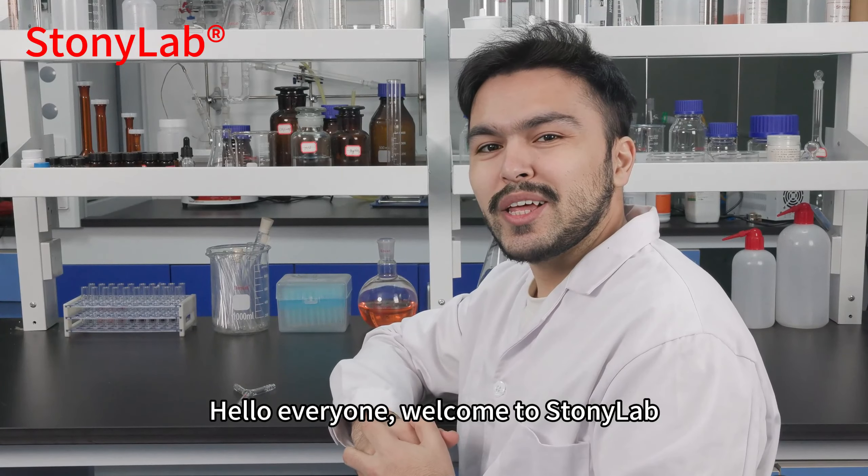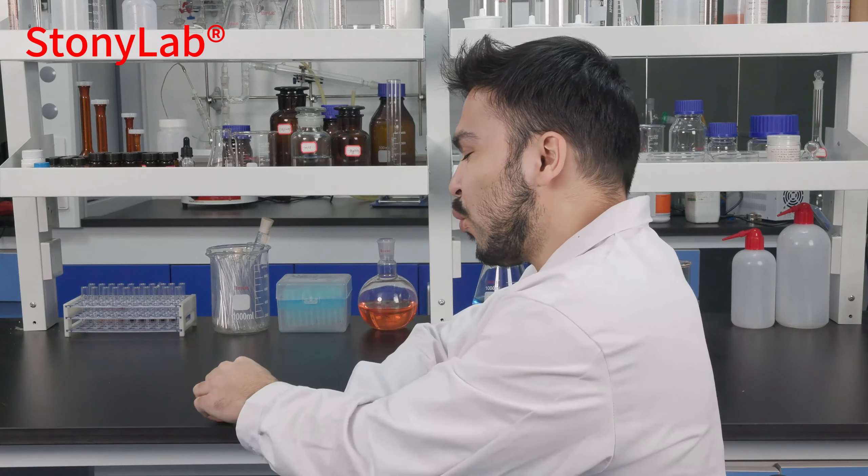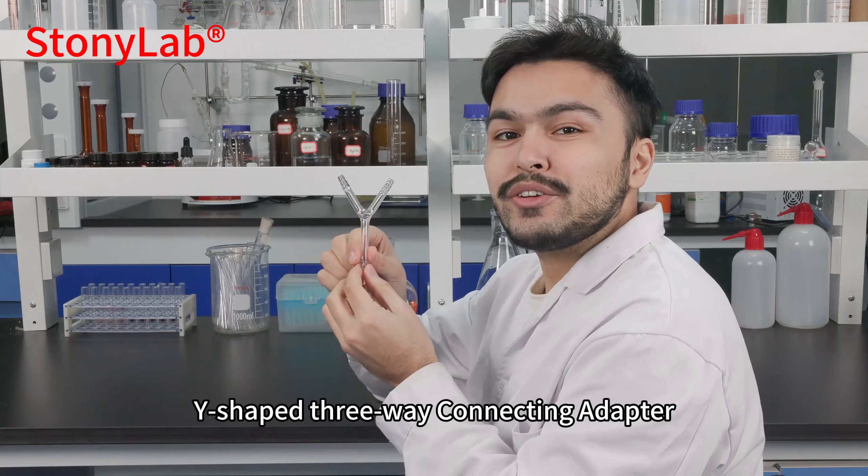Hello everyone and welcome to StonyLab. Today, what we would like to introduce is our new product, the Y-shape 3-way connecting adapter.